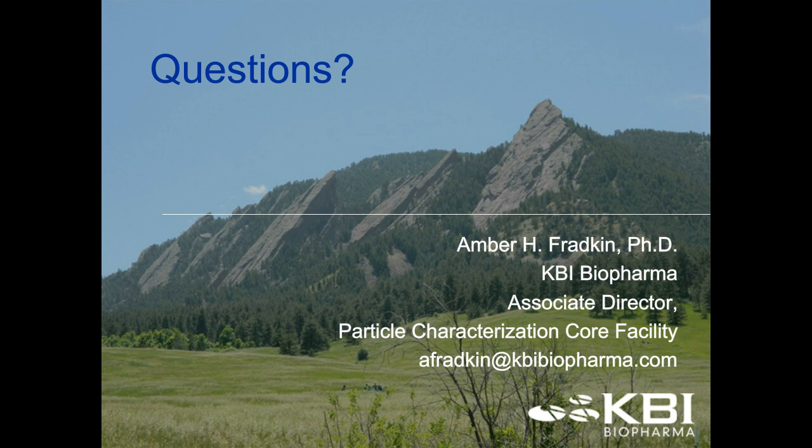I've actually seen them to contribute a lot, I'll say that. As I mentioned briefly, you can take a syringe, expel that syringe and have one particle profile, expel that syringe through an automated delivery device and have a completely different particle profile. I've seen that on numerous occasions. I've actually seen where reconstitution devices, these little widgets that folks use to aid in reconstitution of, say, lyophilized products, can have a major impact on the particle profile post-reconstitution. We've seen certainly examples of that.